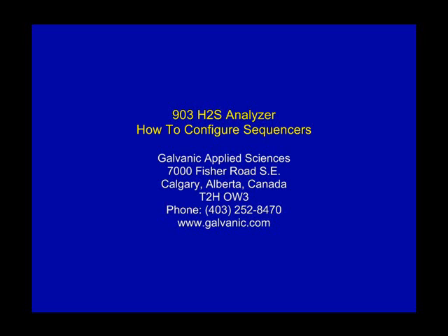In this video we will show how to configure sequencers. For information on how to physically connect to the analyzer, please check the 903 wiring book, which is found on the CD or in the 903 GUI software under the Help menu. Start the 903 Analyzer software.